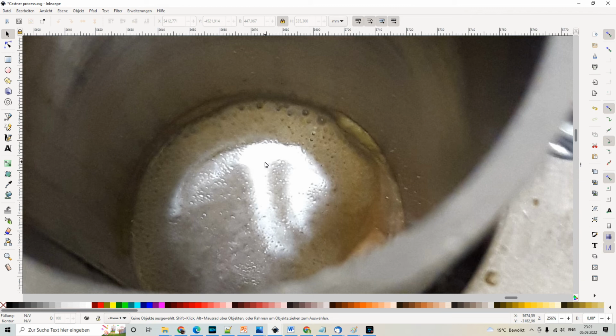Actually, these small tiny bubbles are also causing the problem with the sodium hydroxide spray in the air, because each bubble bursting will create some spray. So some tiny chunks of sodium hydroxide will be airborne and being carried out by the hydrogen, and when you breathe that stuff, it's really not good to breathe it, so wear a respirator.